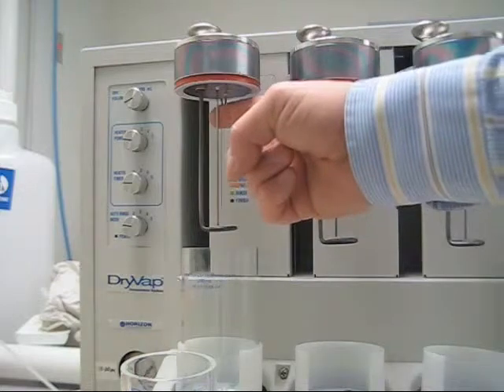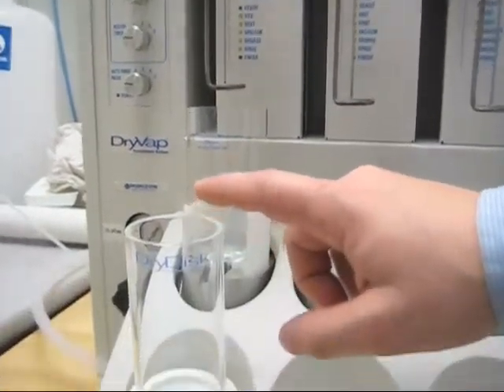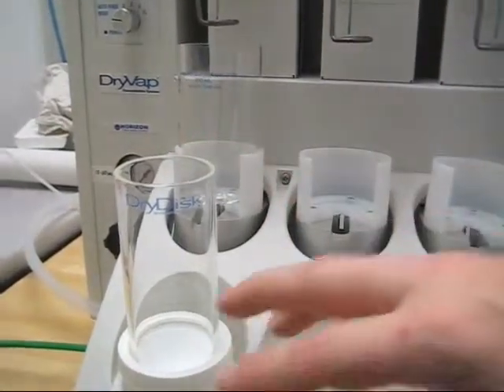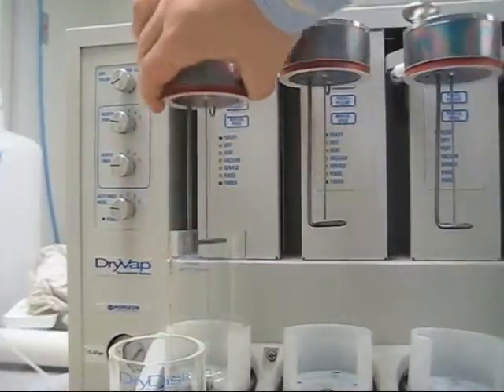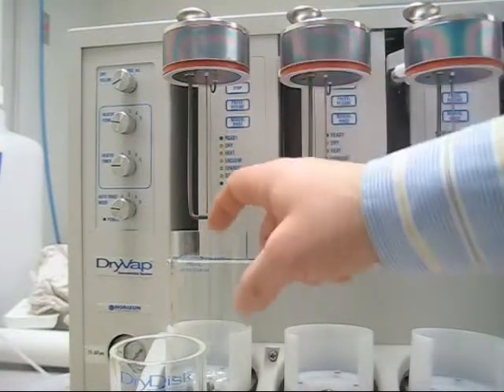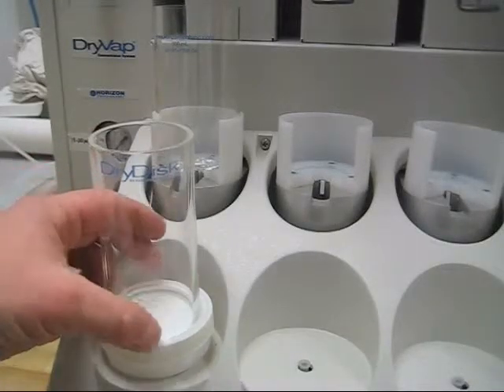The next part here is your sparge tube. From your dry disk, which is located right here, your sample is poured into your dry disk. A suction is pulled onto the assembly here, which runs down through your sparge tube and is introduced right into your concentrator tube.